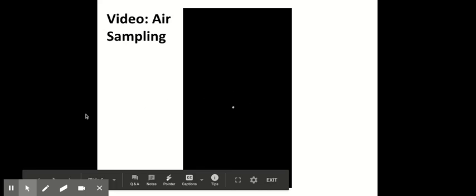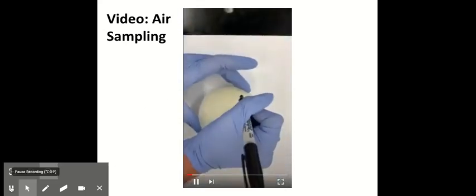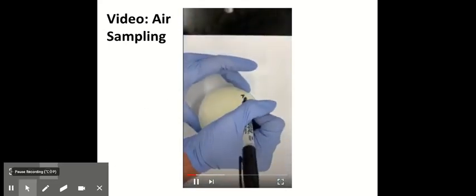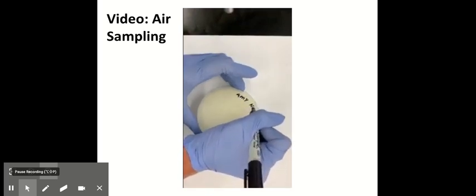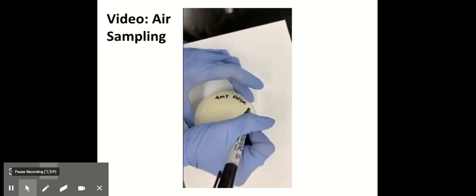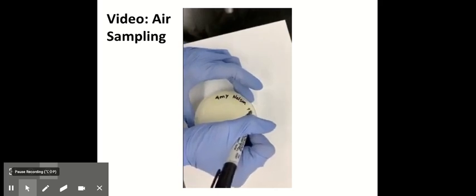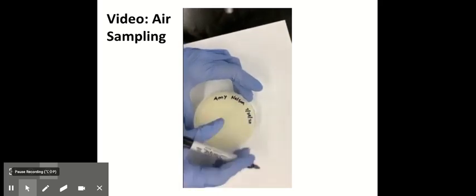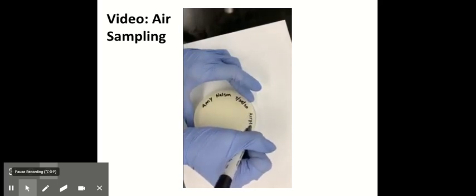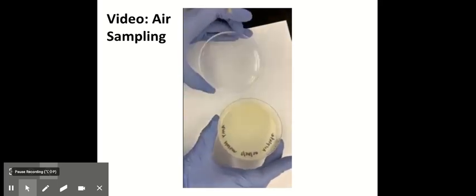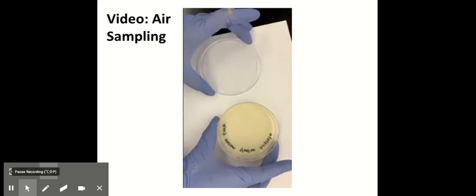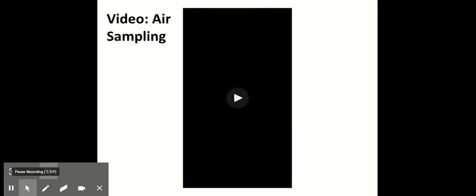So here's a video of how we would do passive air sampling in the lab. As I said, you would write your name on the plate. And remember, you would write it on the agar side of the plate, not on the lid. And also the date and the sample, whatever you're sampling. In this case we're doing an air plate. You would just open up the plate, take off the lid and leave it out for 30 minutes to get a sample.